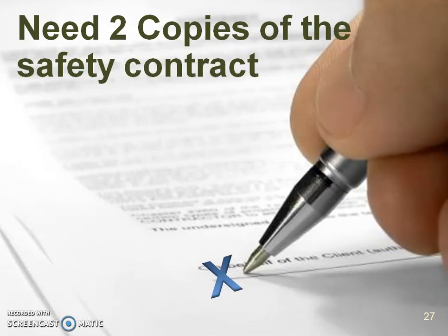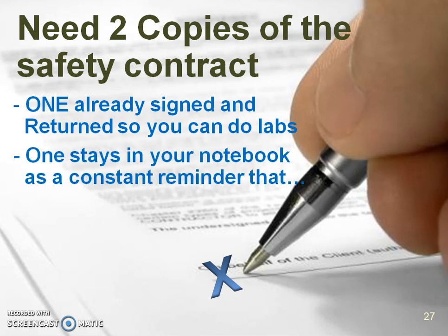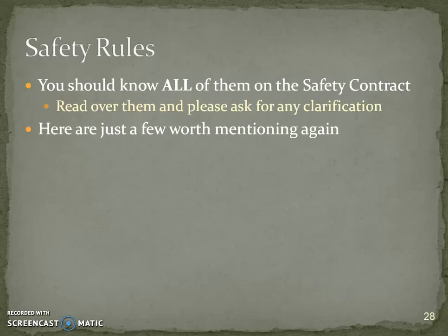Your safety contract is very, very important. You should have gotten two copies. One you're going to get signed and it must be returned in order for you to do the labs, and the other one stays in your notebook as a constant reminder that safety is the number one priority. Read over all those safety contract rules and if you need clarification, please ask.